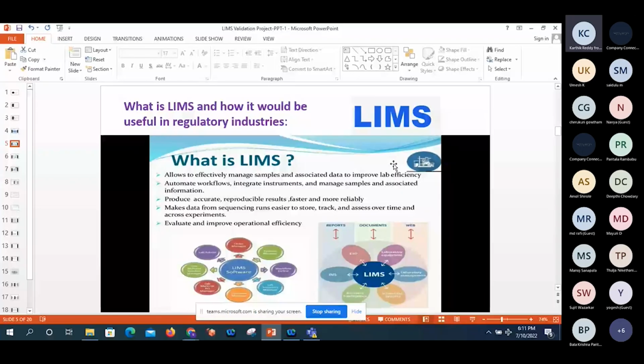Master data plays a very important key role in LIMS. Why? Because whatever data is currently available in specifications, standard testing procedures, and protocols on paper, we need to enter into the LIMS management tables. There are a table manager and explorer tables in LIMS. There are huge numbers of tables, nearly 200 to 300 for each vendor, like Labware LIMS. Once this master data is completed, we move to the production environment, where people can use it for generation of samples.